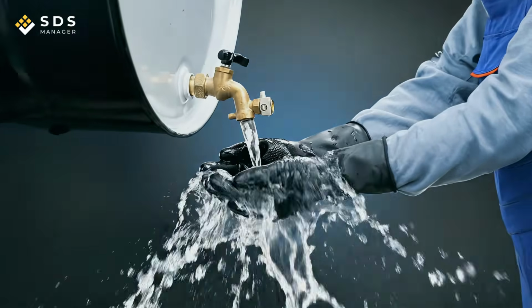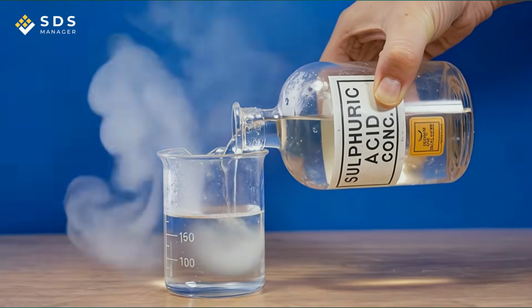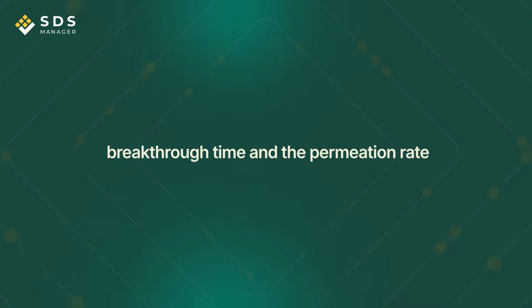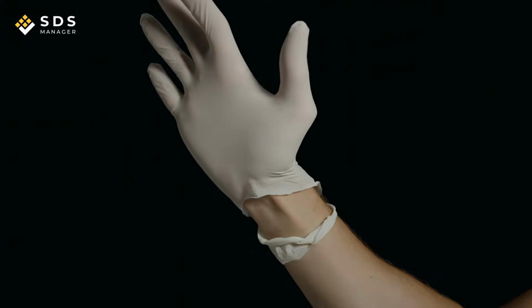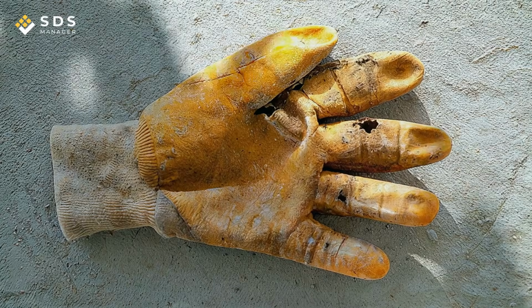Butyl rubber gloves are recommended for highly hazardous chemicals, such as ketones, esters, and concentrated acids. Two key factors to check are the breakthrough time and the permeation rate. Both values should be matched against the chemicals being handled and the duration of the task. Gloves should be inspected before every use and replaced immediately if torn, discolored, or showing signs of degradation.